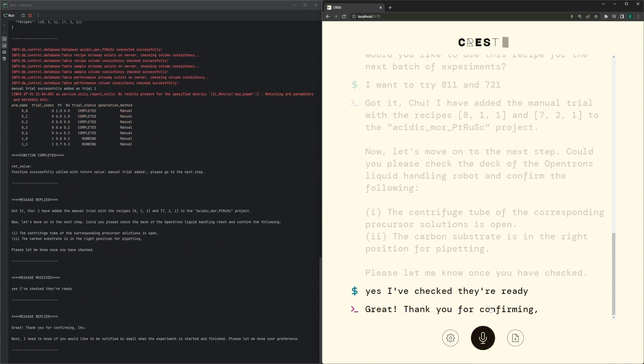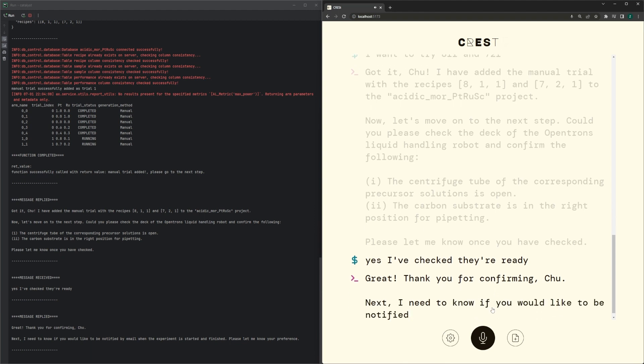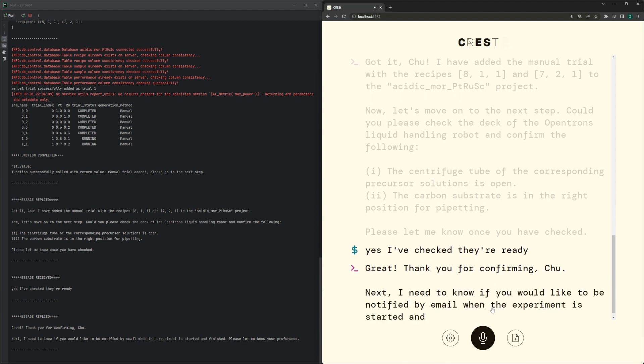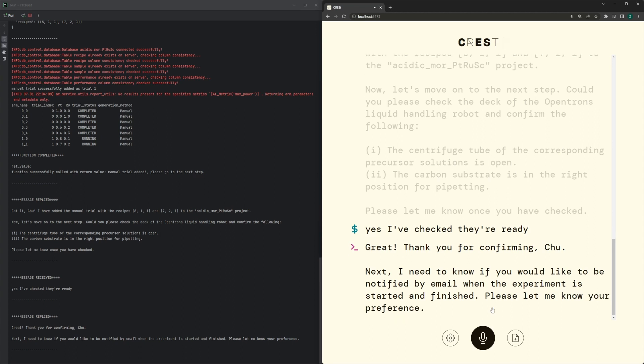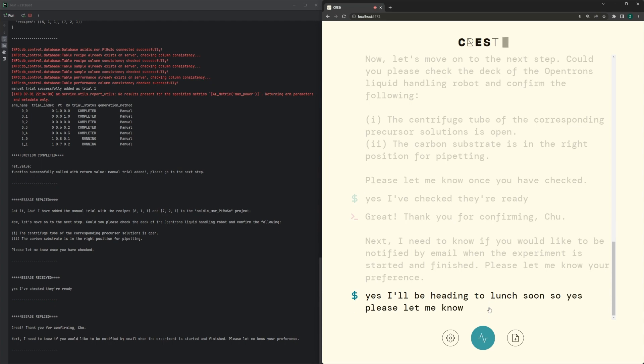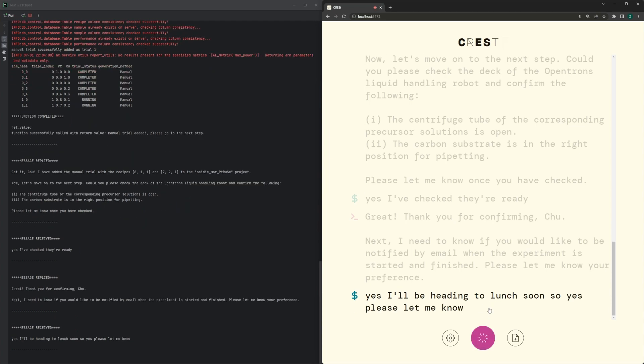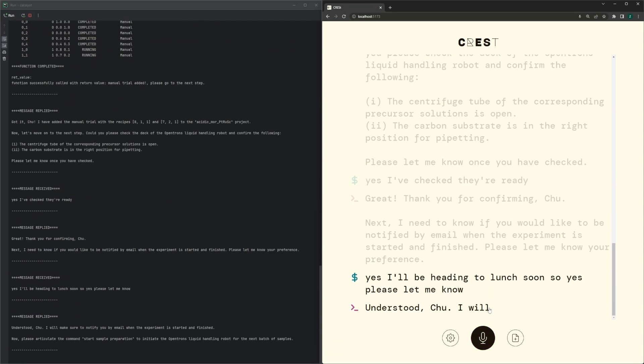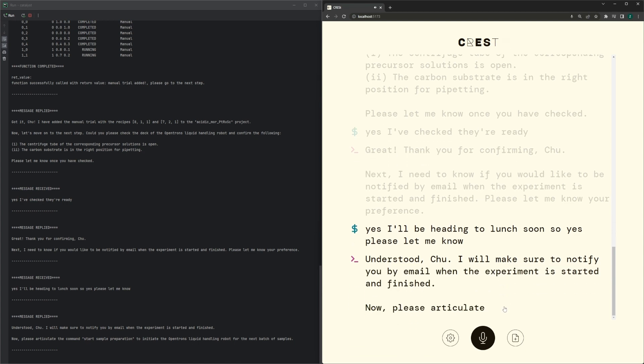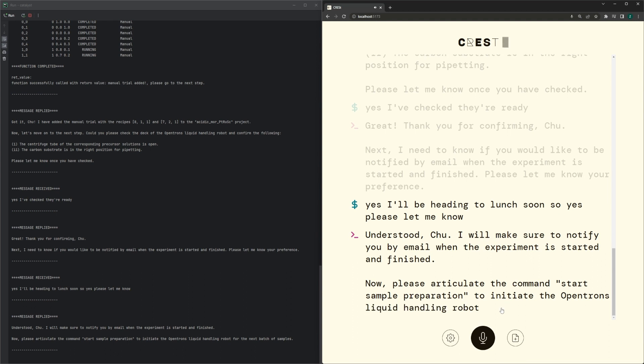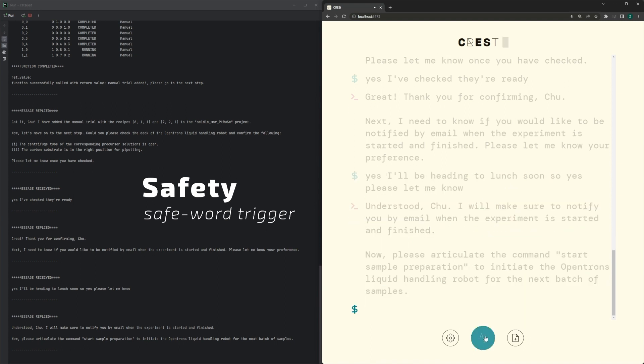Great! Thank you for confirming, Chu. Next, I need to know if you would like to be notified by email when the experiment is started and finished. Yeah, I'll be heading to lunch soon, so yes, please let me know. Understood, Chu. I will make sure to notify you by email when the experiment is started and finished. Now please articulate the command start sample preparation to initiate the Opentron's liquid handling robot for the next batch of samples. Start sample prep.